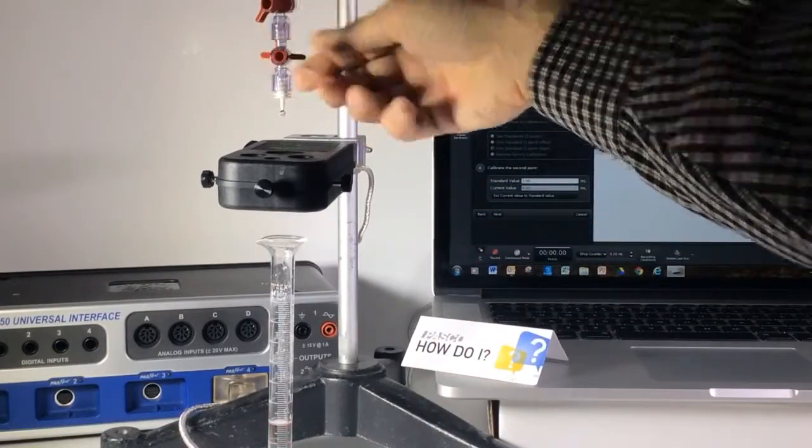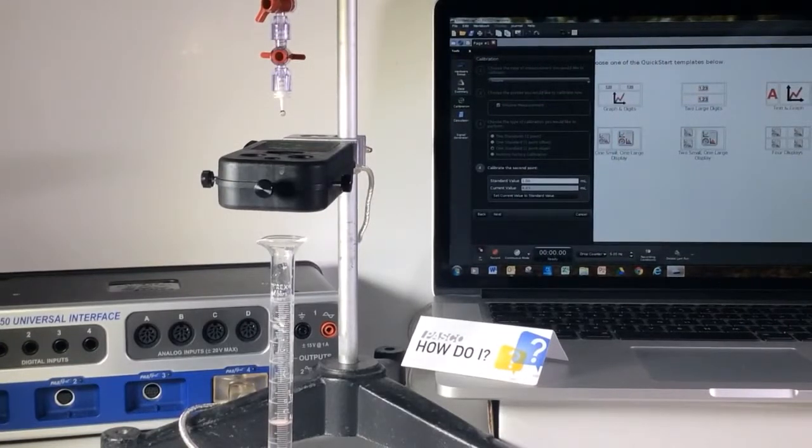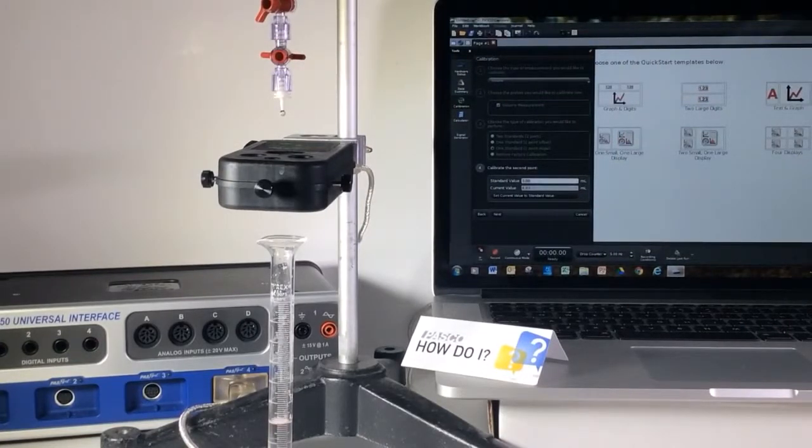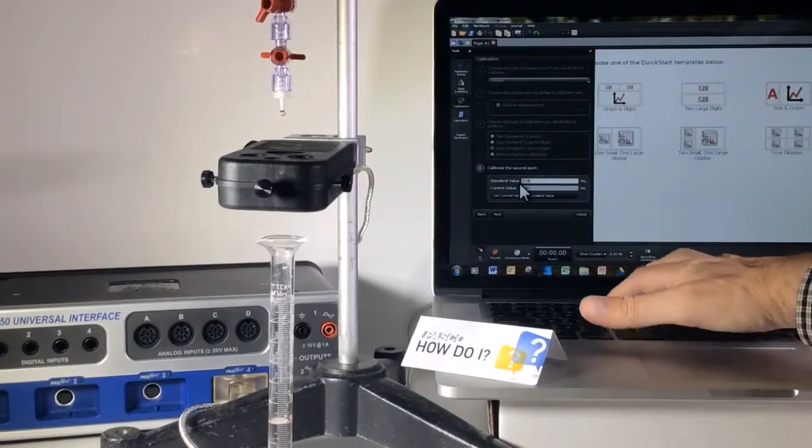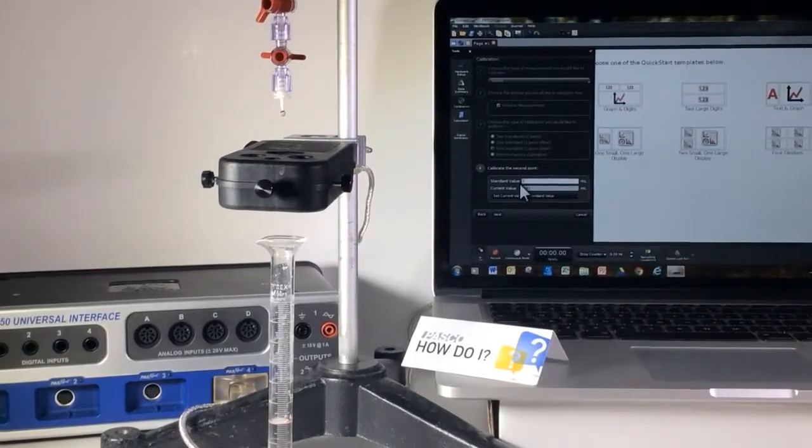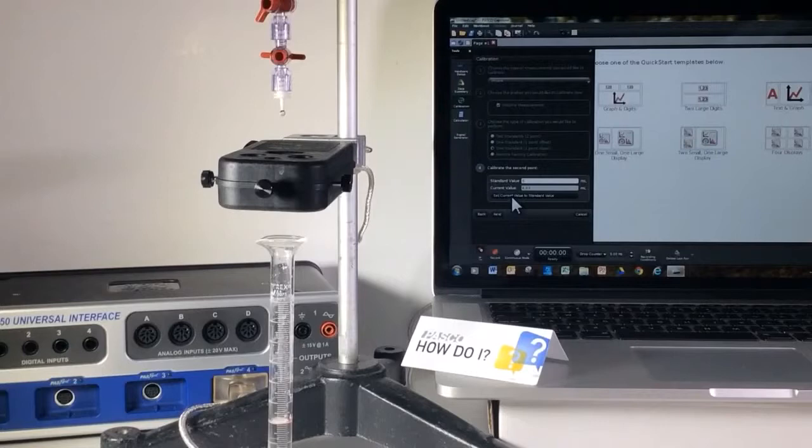I'm going to stop there. I just hit 4. You might not be able to see that. So here at the standard value I'm going to type in 4, then I'm going to say set current value to standard value.